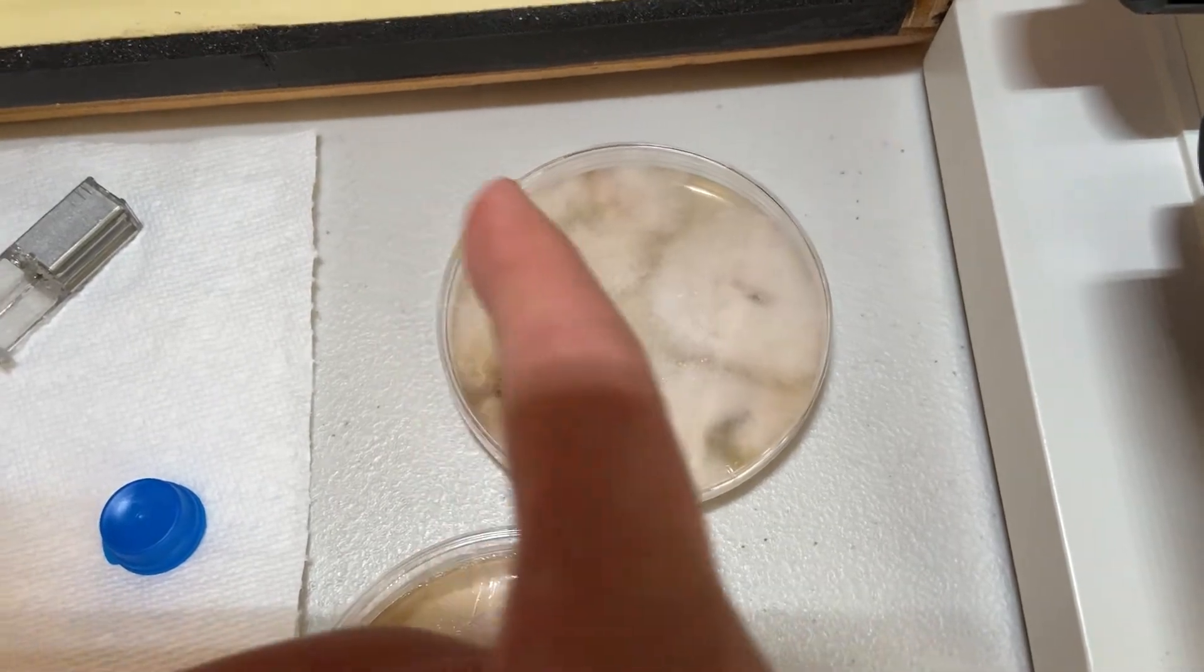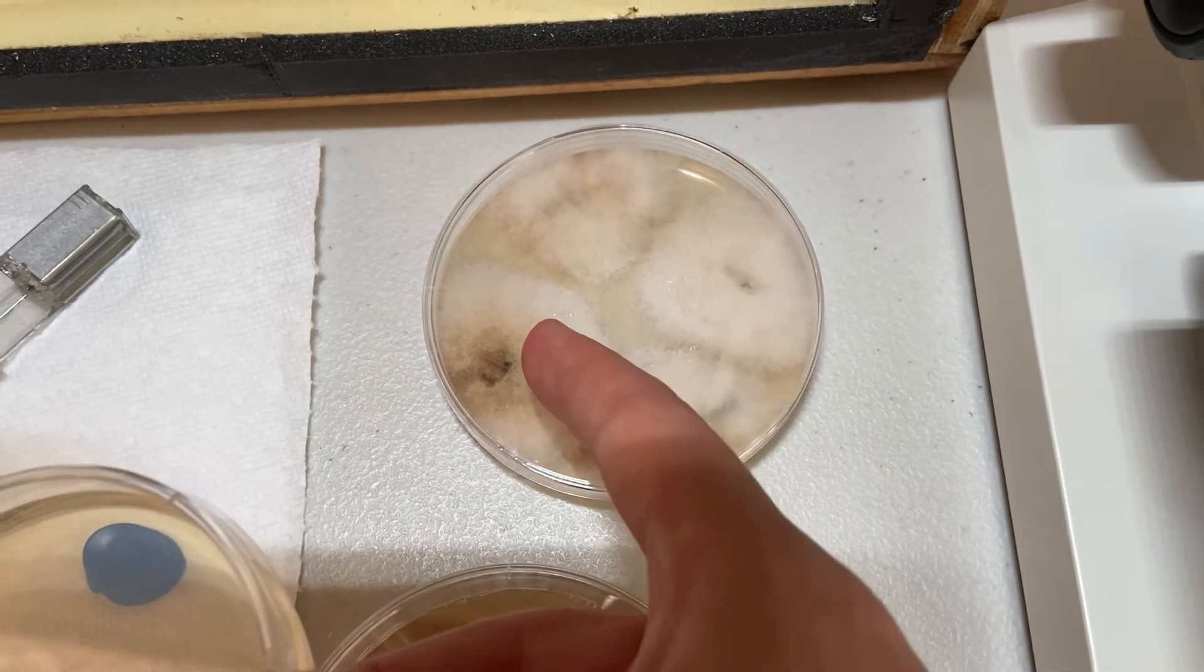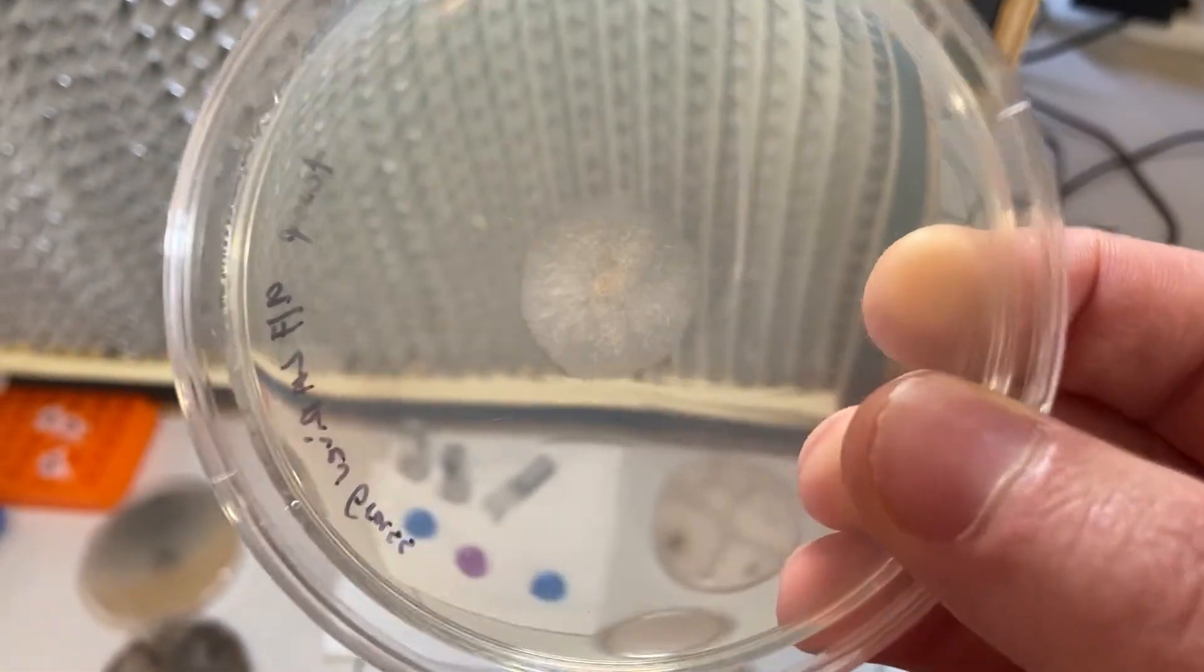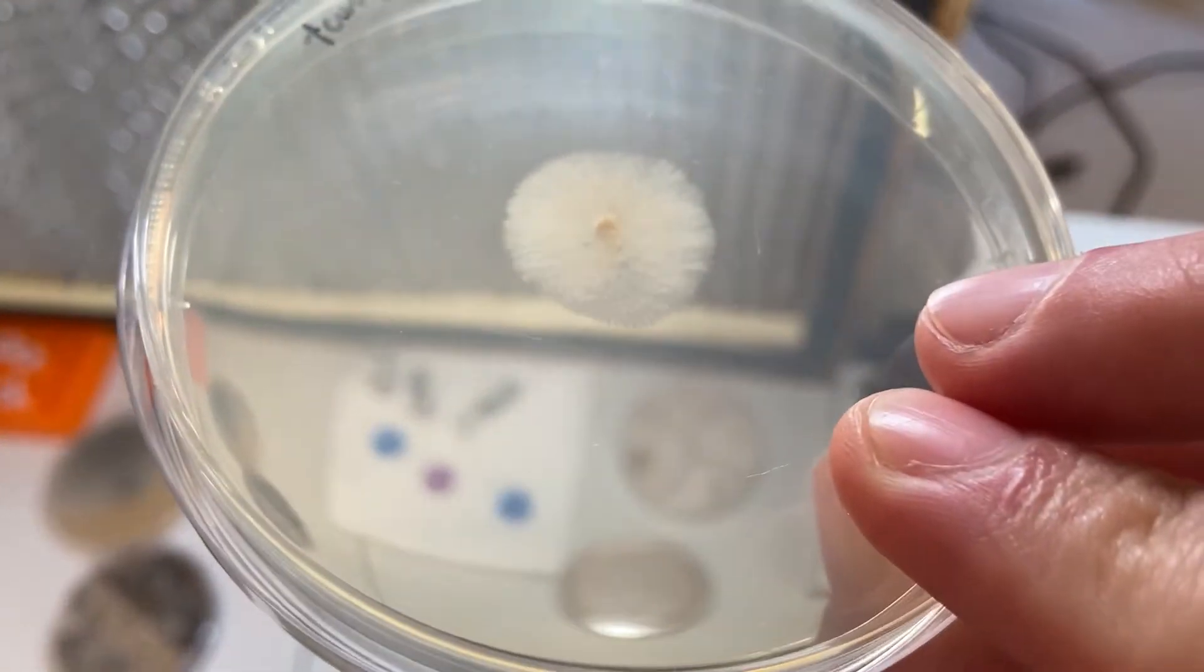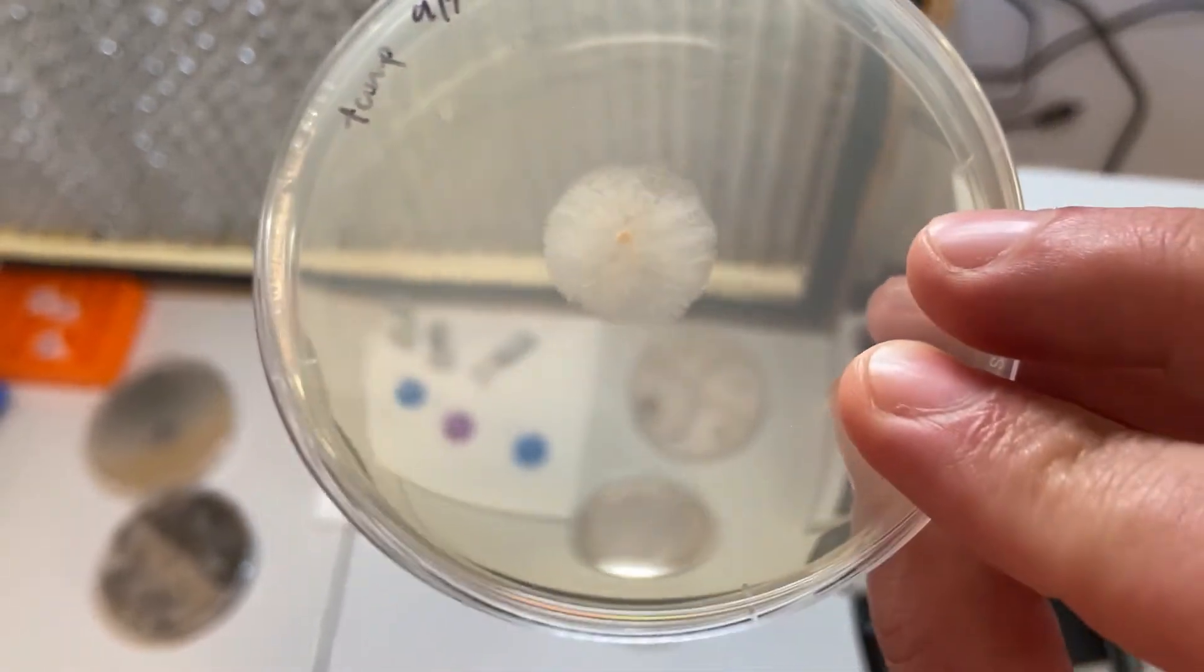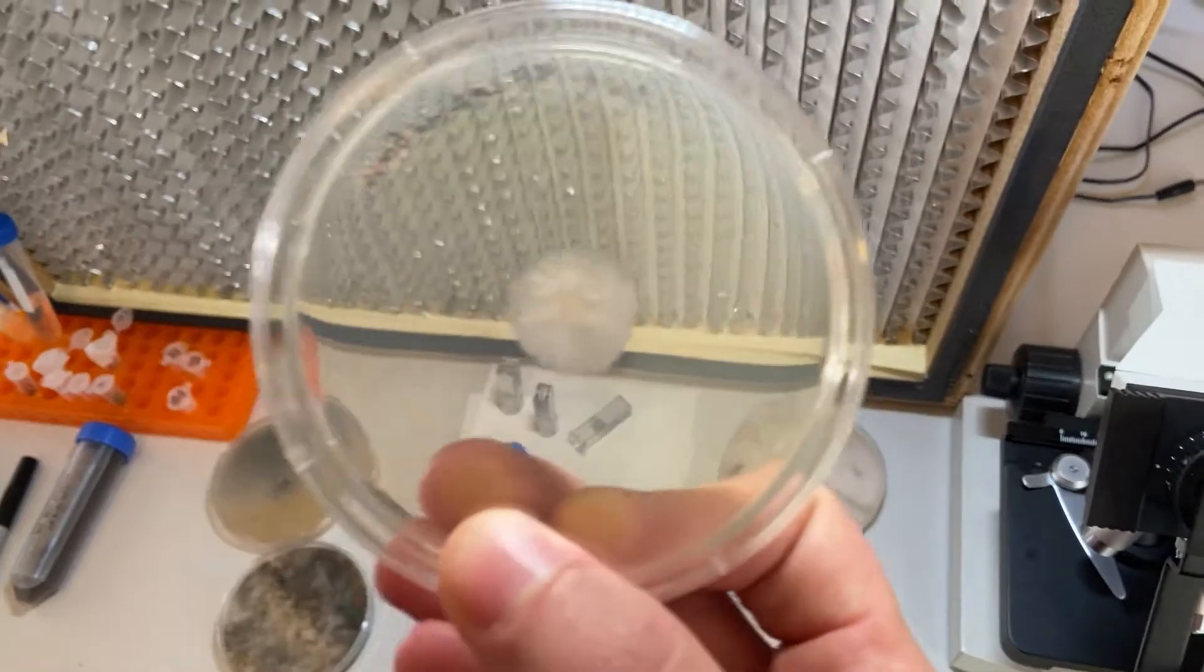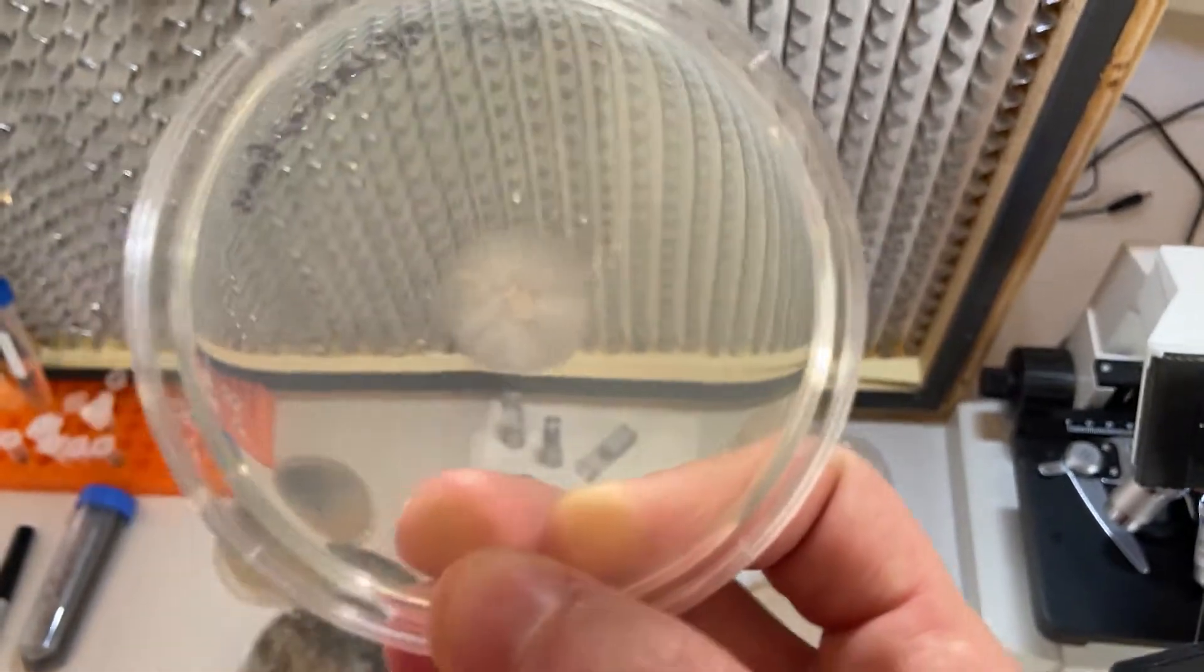After just two days of isolating one of these colonies away from the grass, here are the results. You can see it's growing pretty nice and isolated. There's a single growth, only one colony, and it's already starting to produce that same orangish pigment that it produced in the other plate. This is an example of what a nice clean isolate will look like.